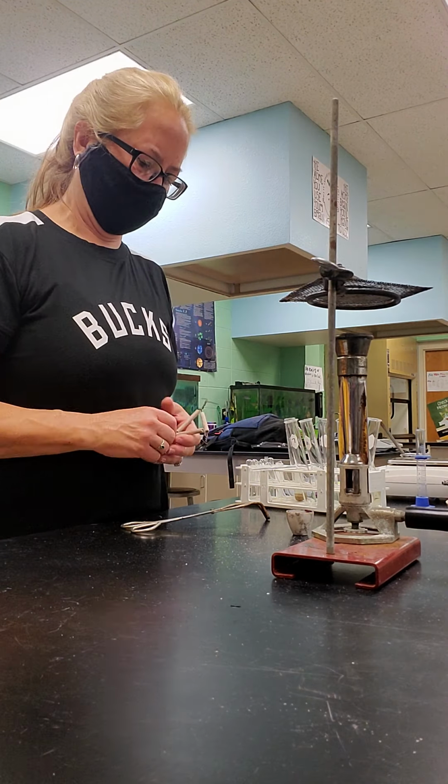All right. So, what happened to it? It turned colors, it turned blue. Okay, so you write down CoCl2 is the cobalt chloride, it turned blue when we heated it. Now we're gonna add water back to it. And what happened to it? It turned purple, so it turned a different color. Okay, so there's that one.